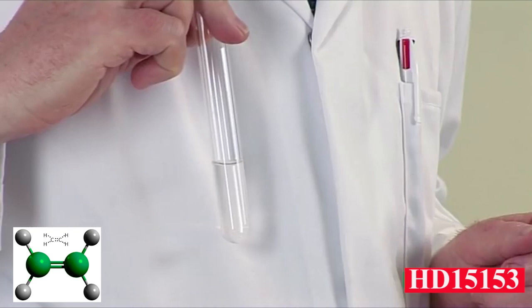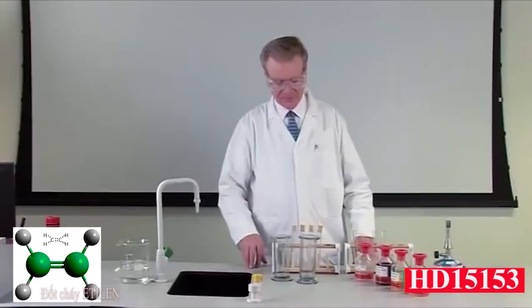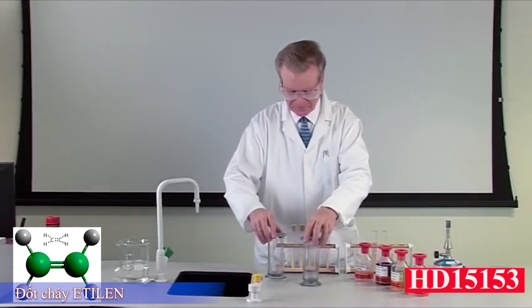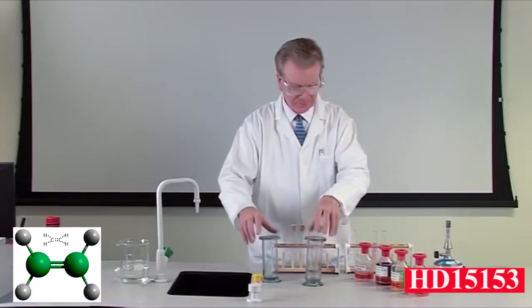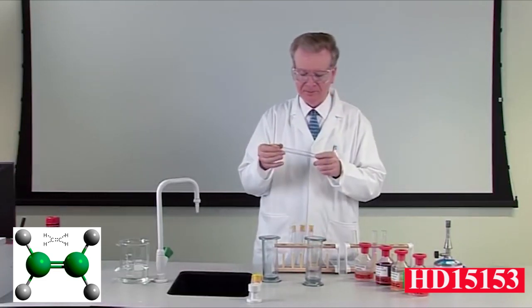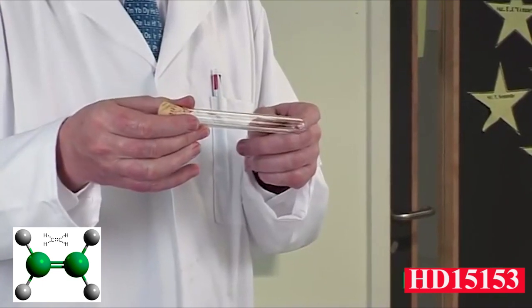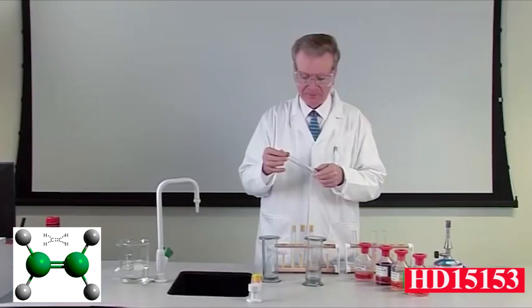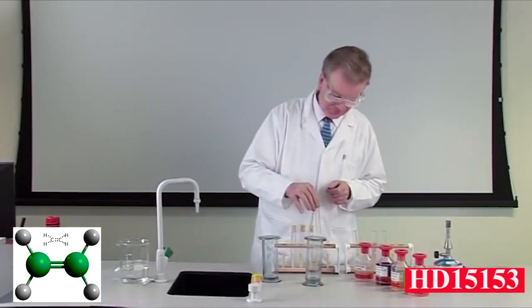This concludes the study of the chemical properties of ethene. In the next part of this experiment, we will examine the physical properties of ethene. Note the physical properties of ethene. It is a colorless gas with a sweetish smell. The fact that the gas can be collected over water shows clearly that it is insoluble in water. Otherwise, the gas would simply dissolve in the water instead of bubbling through it.